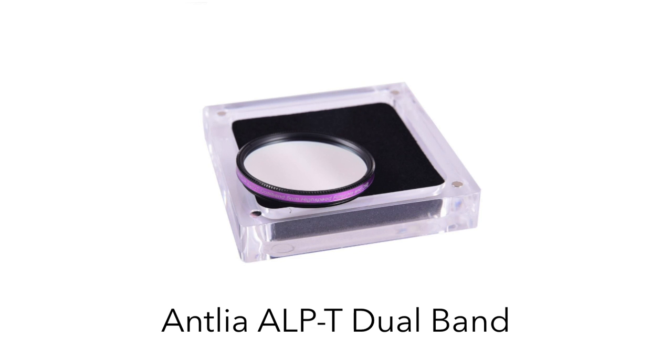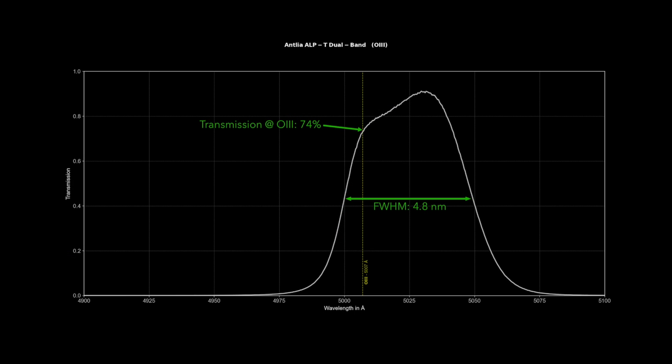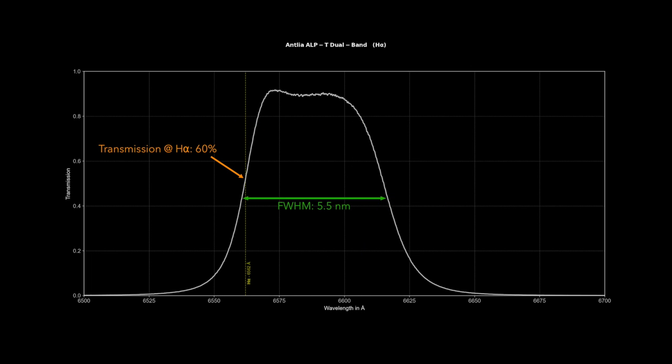Our final victim is Antlia's ALPT dual band, so-called golden filter, because it looks golden yellow when you look at it in daylight, and some people have joked that it is more expensive by weight than gold. Anyway, Antlia advertises a 5 nm bandpass in both H-Alpha and O3, and a peak transmission of 82% for O3 and 90% for H-Alpha. My measurements confirmed the 5 nm bandwidth, but the transmission numbers were slightly off, with 74% for O3 and a disappointing 60% for H-Alpha. This looks like a pre-shifted filter, which would likely do very well with a very low focal ratio, like F3 for example.